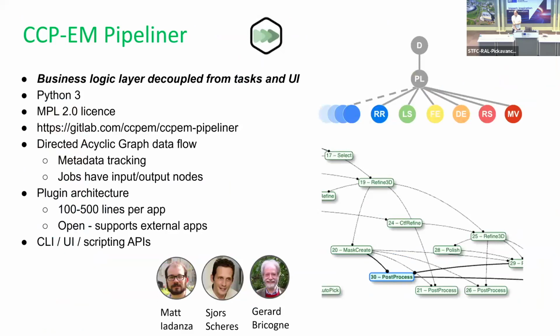So moving into the EM world. I mentioned the CCP EM software suite. The bit for this talk is the Pipeliner, which is the business logic layer underneath the CCP EM suite. This has been written from scratch in the last few years.